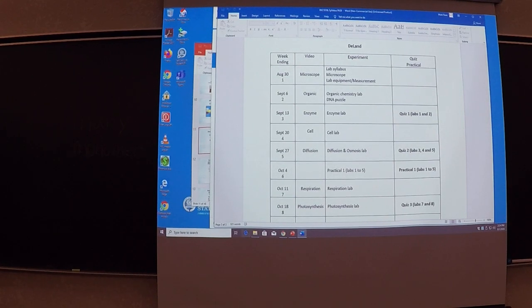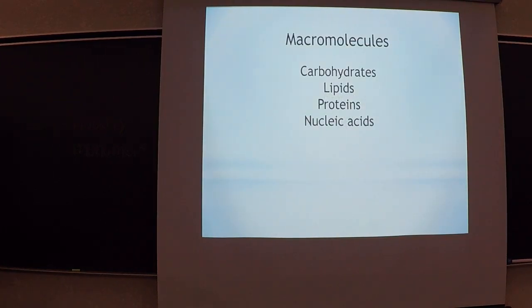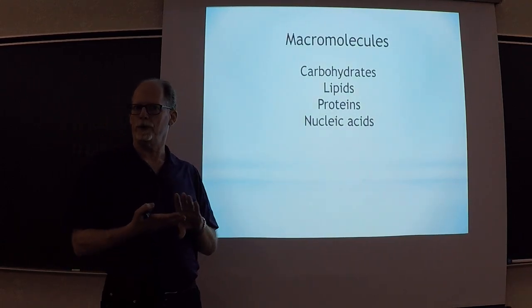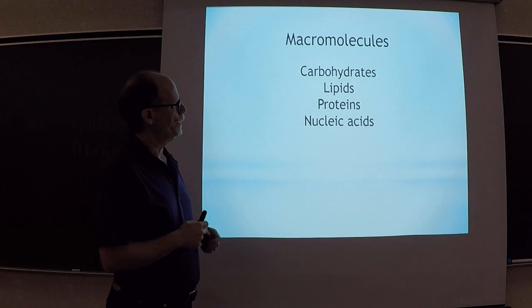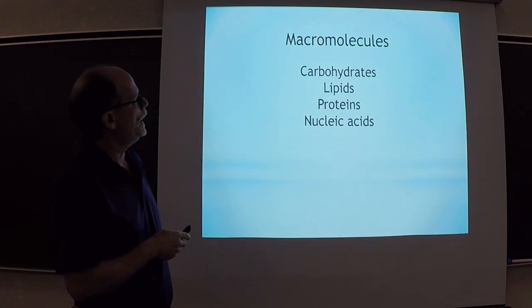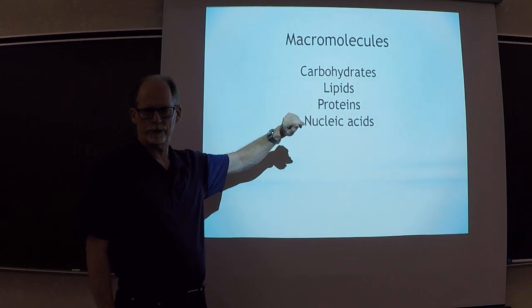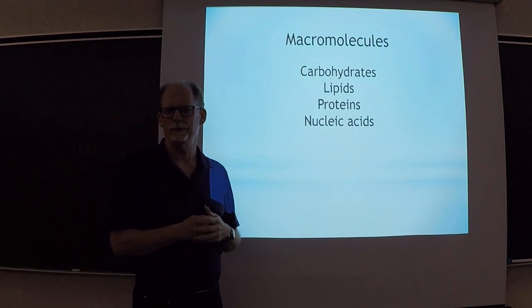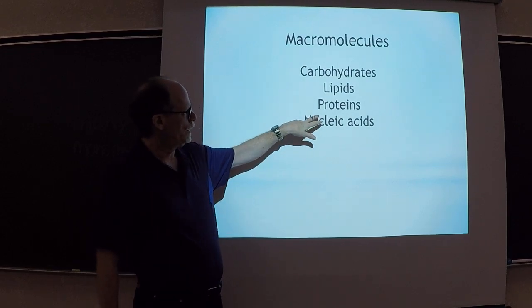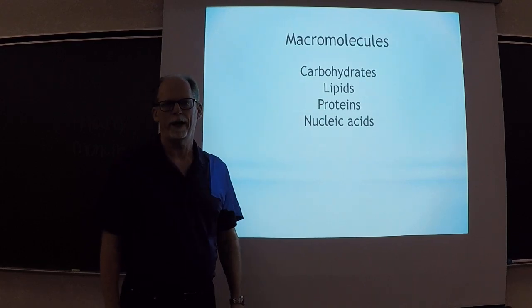So this is the lab PowerPoint. All right, I told you it's a good idea to study the lab PowerPoints for the quizzes and for the practicals. Okay, so the organic chemistry lab really is, macromolecules is just another name for them. They're all organic molecules. In this lab, what we would be doing if we had a lab face-to-face would be to complete tests to detect lipids, proteins, and carbohydrates, right?